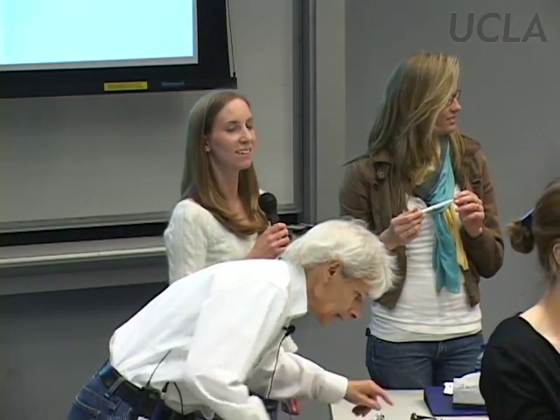Okay, go ahead. So if everyone can take your swab, and Daisy's going to demonstrate this, take a pen and write your name legibly on it. You have to write your first name, your last name, and write it very, very clearly. It says sample ID on the white label on your tube, so write it in that area.